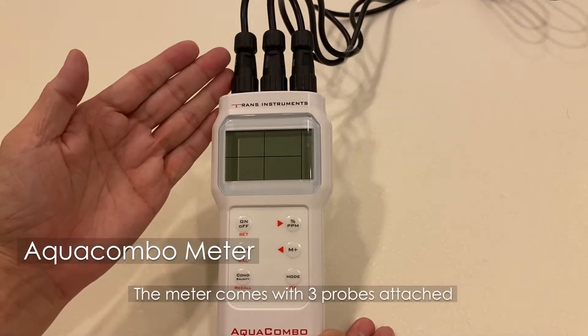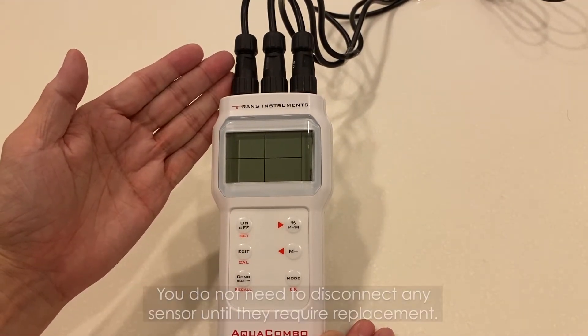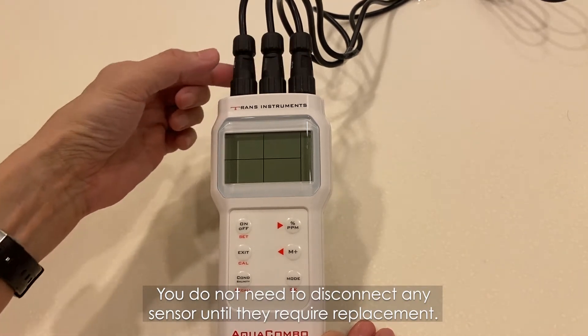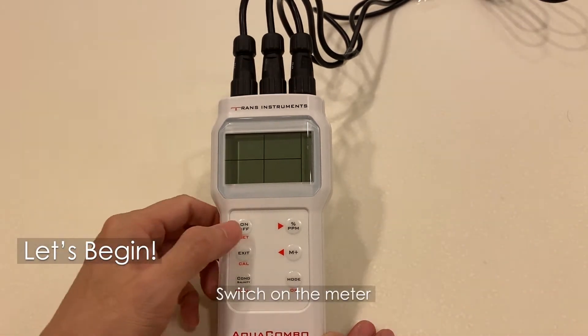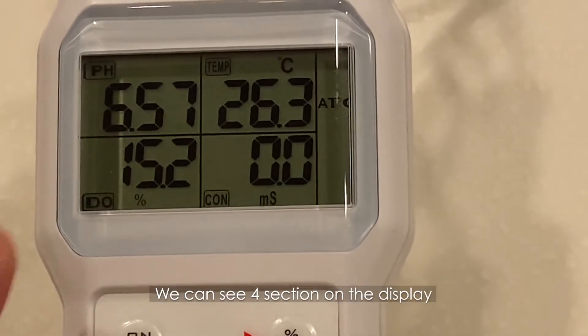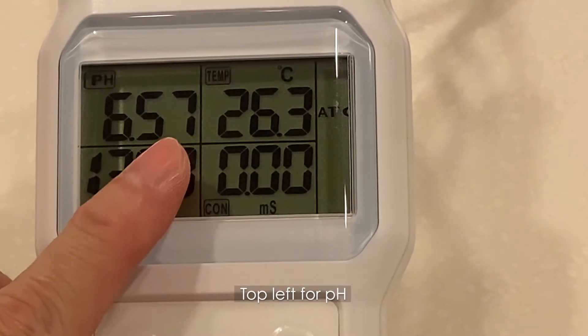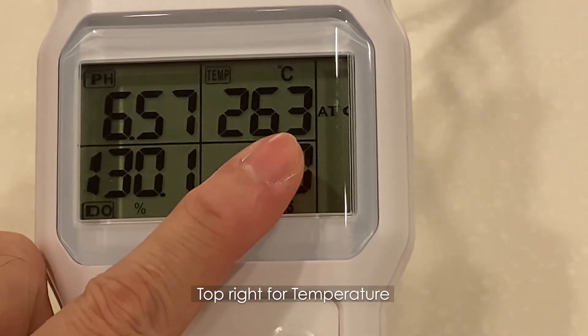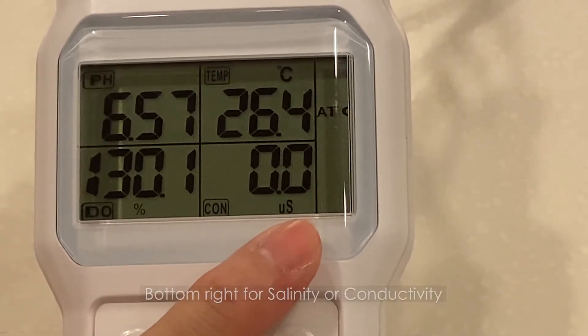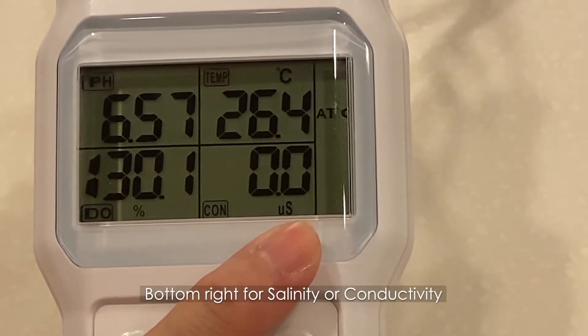The meter comes with three probes attached. You do not need to disconnect any sensor until they require replacement. Switch on the meter. We can see four sections on the display: top left for pH, top right for temperature, bottom left for dissolved oxygen, and bottom right for salinity or conductivity.